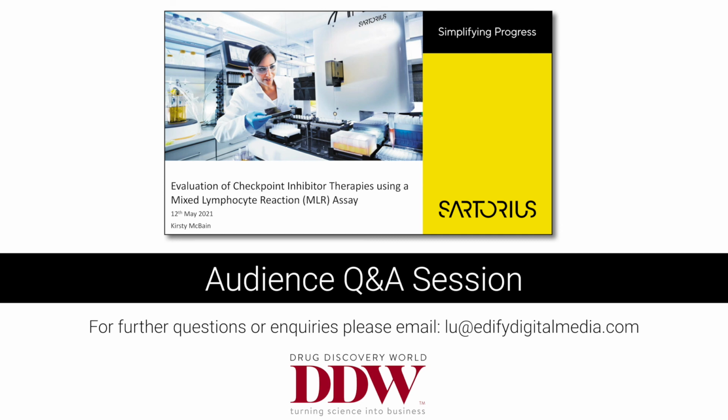Another question here: what was the DC to T cell ratio in the one-way MLR? Aside from that one assay where we had a look at different DC to T cell ratios, we just stuck to the 3:1 T cell to DC ratio throughout the rest of the one-way MLR assays, as we found that that had the optimal activation response.